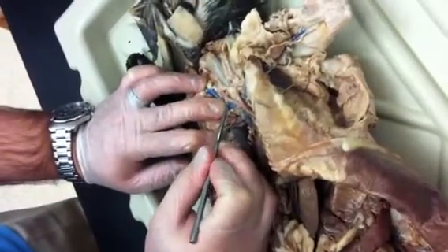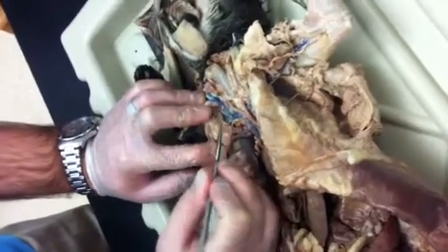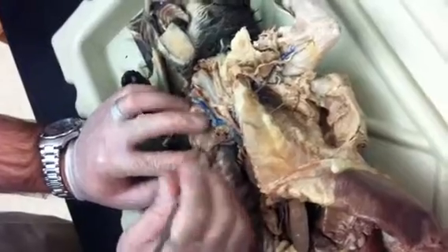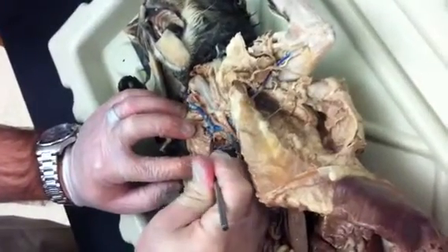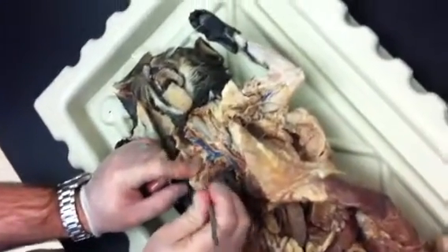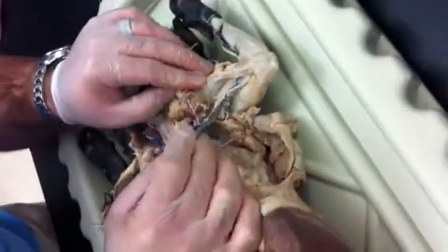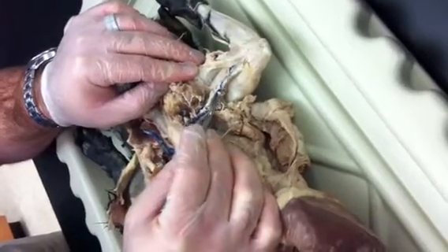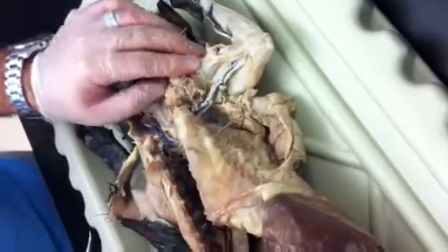Again, it doesn't really appear very long here, but it runs all the way out to the underarm of the cat, the axilla of the cat, where it becomes the axillary artery, which is really more out here. We just don't have it dissected that far, so just trust me, I'll try to find one with that to the underarm. And out in the arm, it becomes the brachial artery, which isn't colored on this side. The dye didn't make it. So the brachial artery is non-dyed over here on the arm.